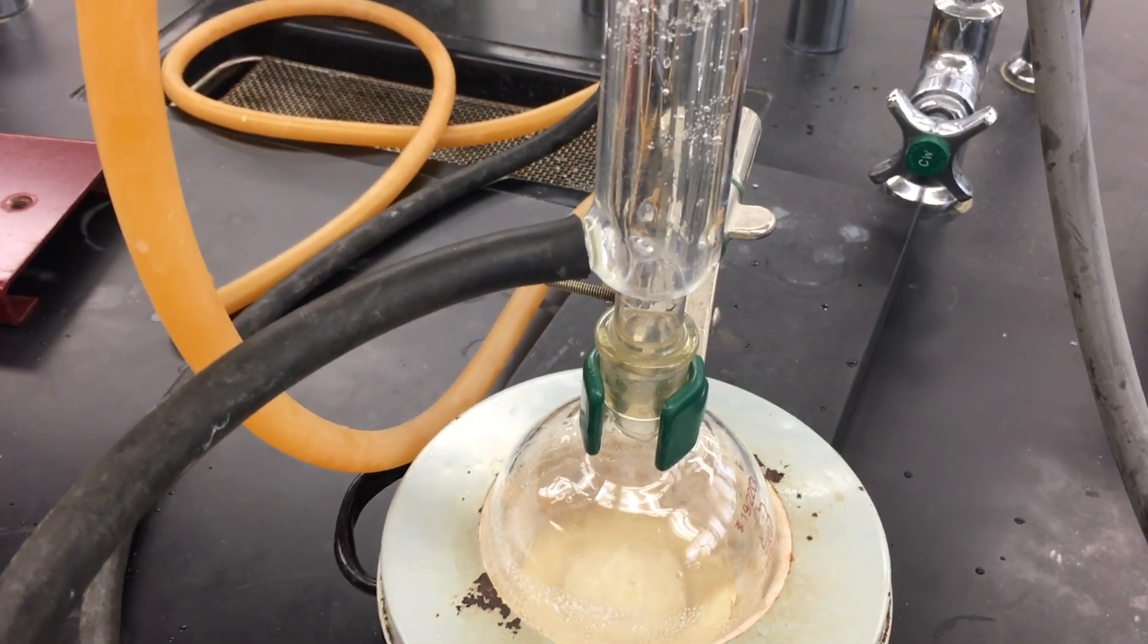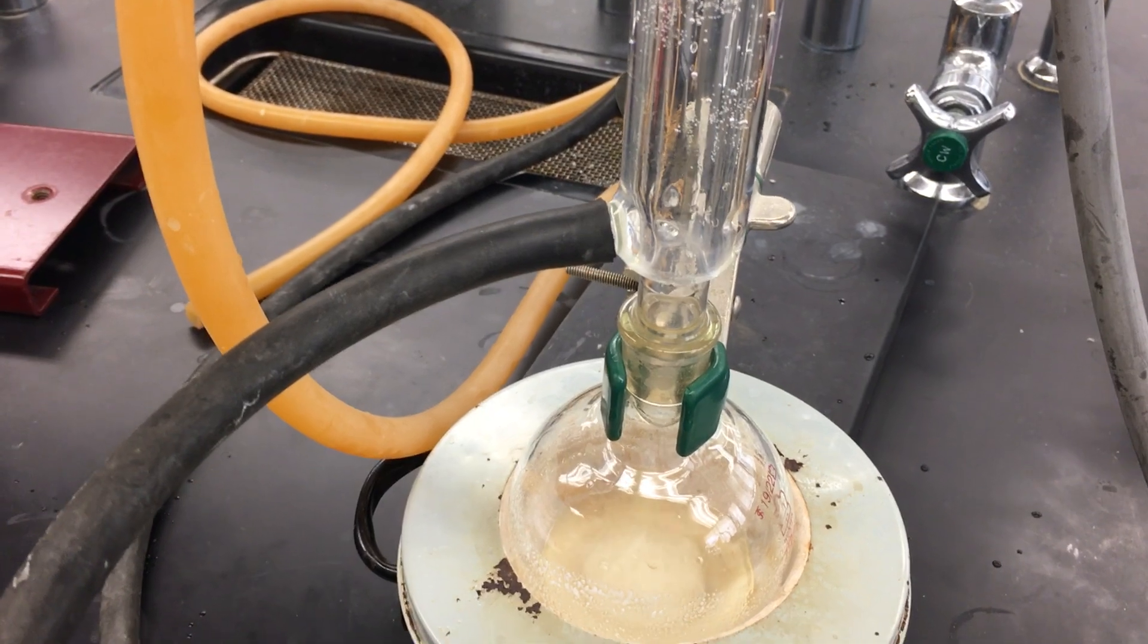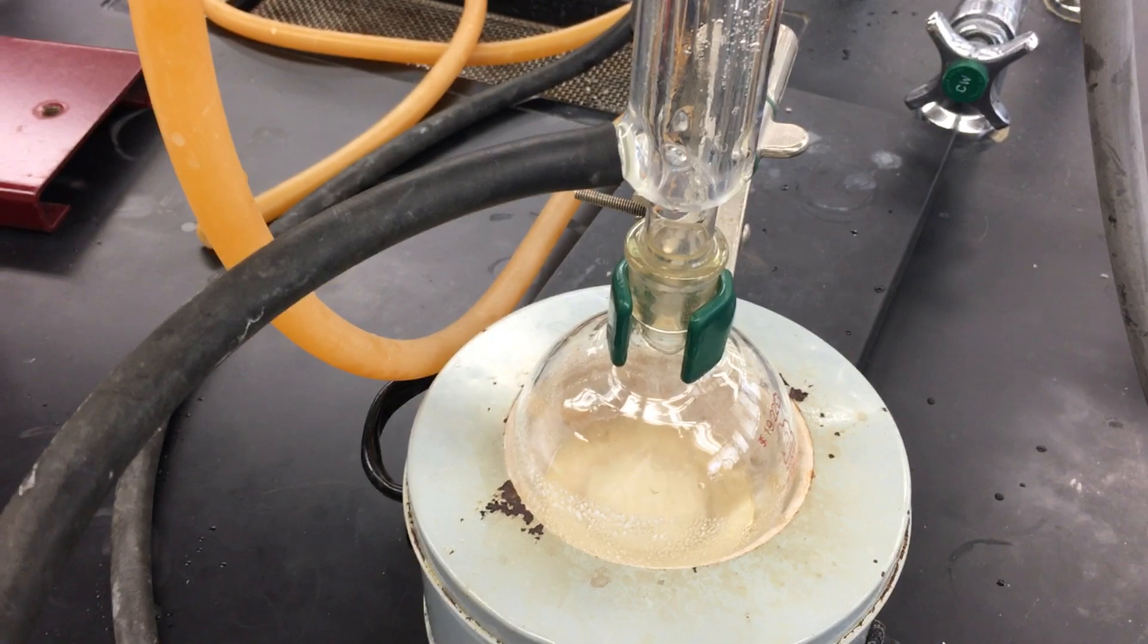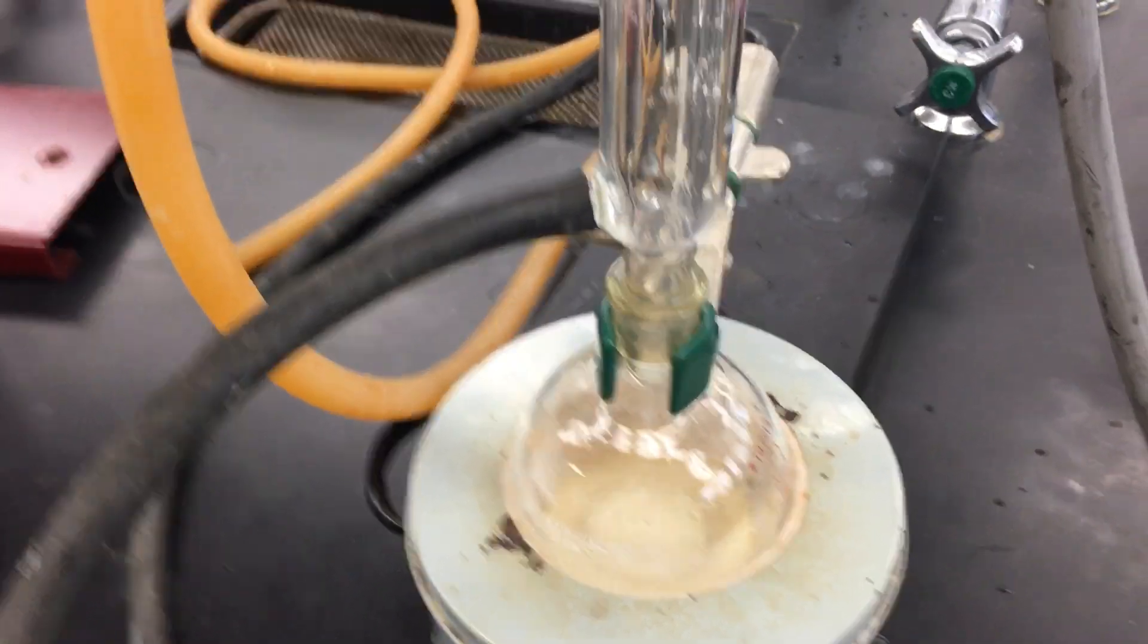The bromide ion reacts with butanol, generating bromobutane. This is the step where the SN2 reaction is actually taking place.